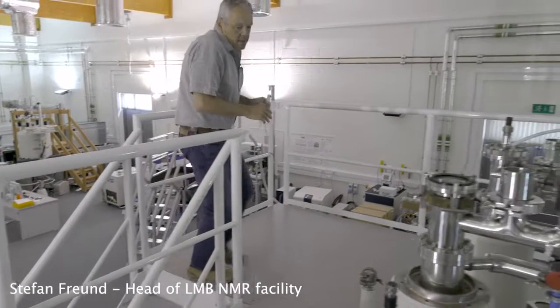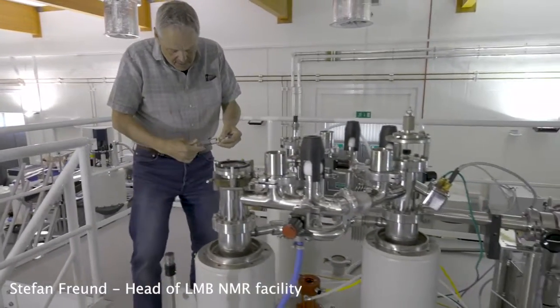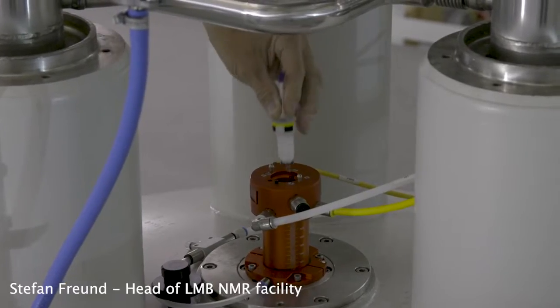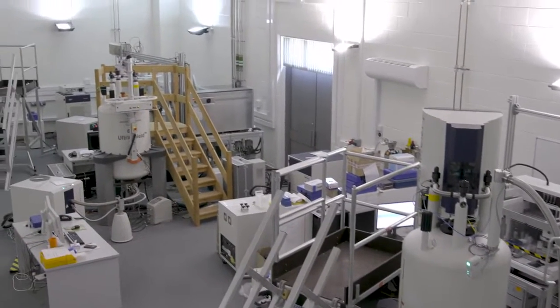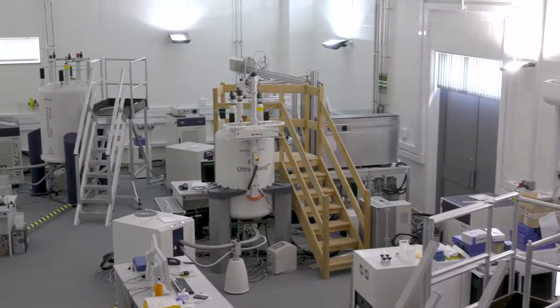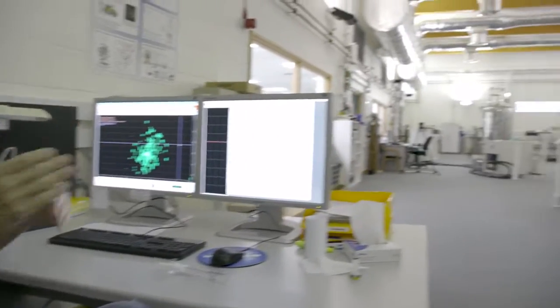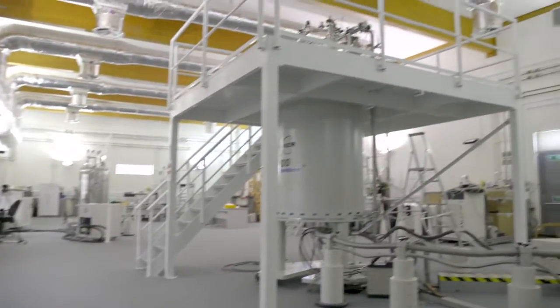NMR spectroscopy in general, I think what you need is a very big magnet. We have multiple big magnets. On an international scale, it's actually a very large facility. To have a system like the 800 MHz spectrometer is actually quite an advantage to be able to use that.